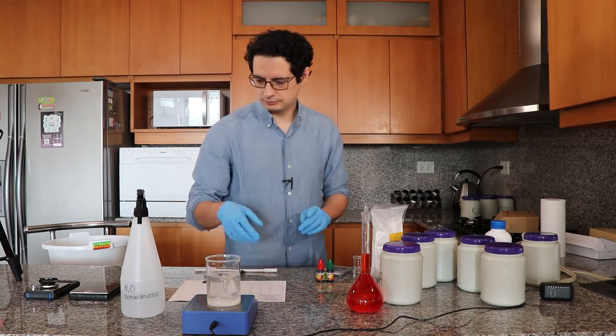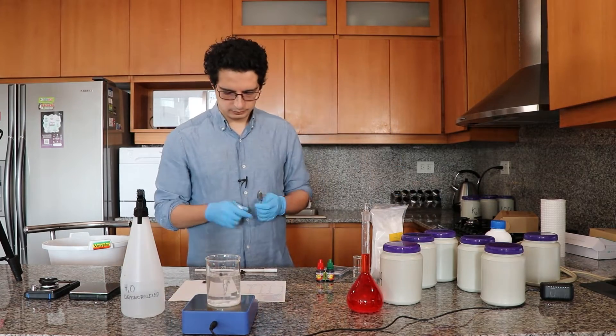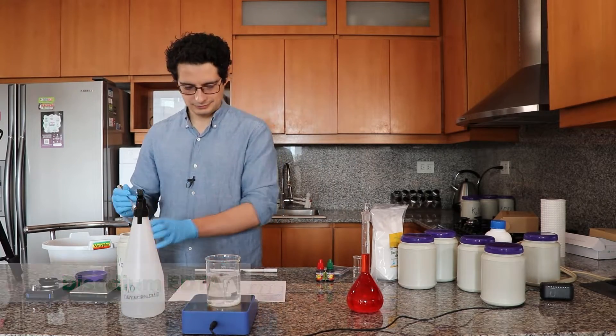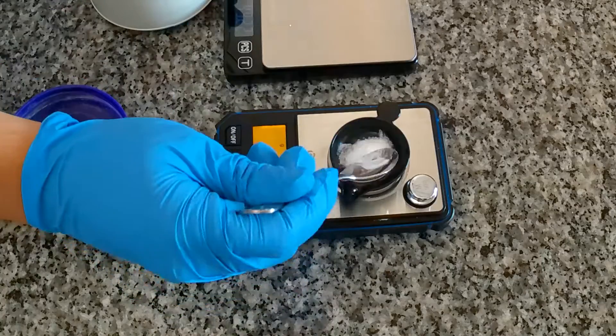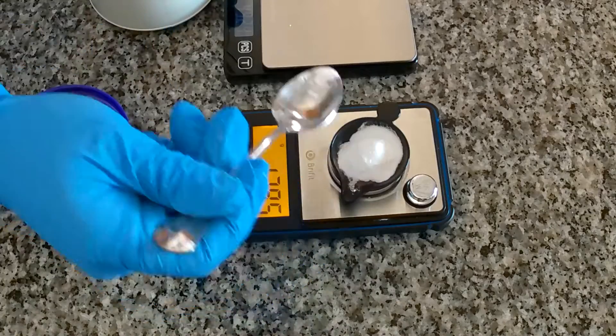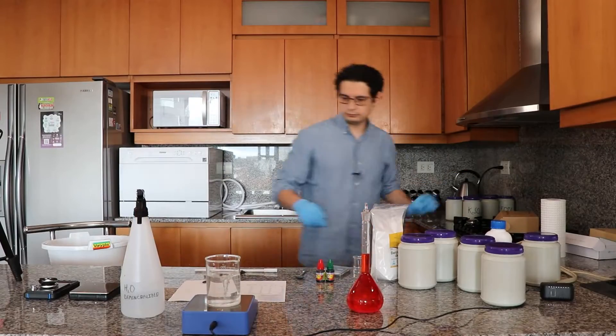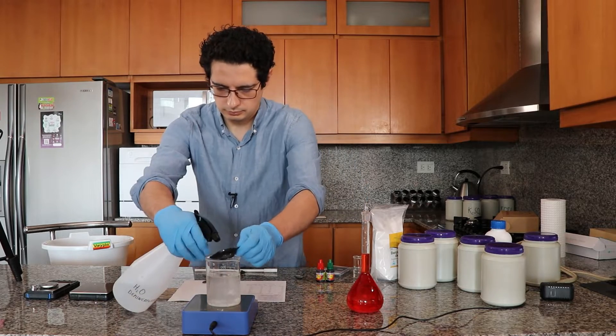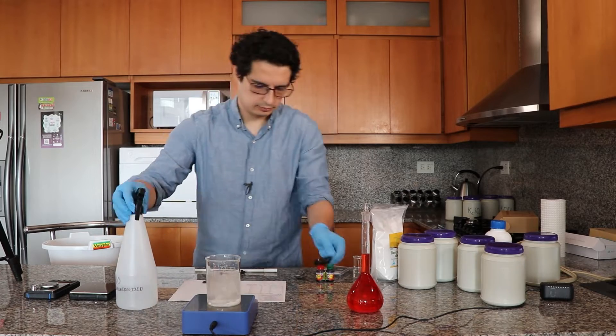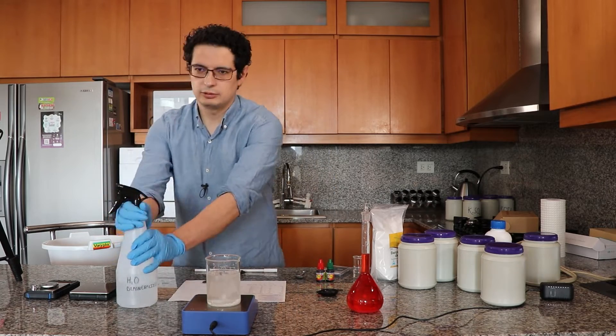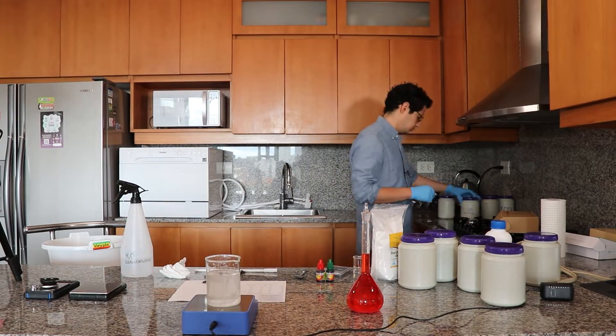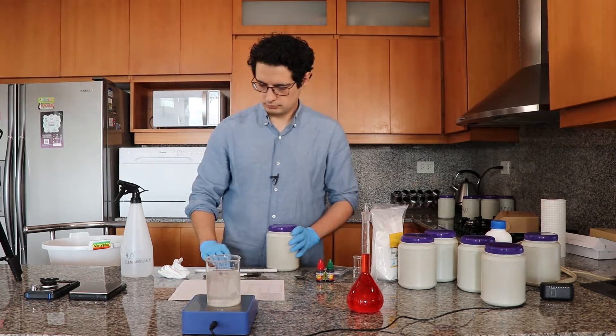After this, all the other substances I'm going to weigh in the smaller scale because we need to weigh a much lighter amount. So next is the sodium EDTA which is the chelating agent. I add it first because I want the chelating agent to be fully dissolved and available before I add the heavy metals so that no heavy metal precipitation reactions can happen, because they could happen if I added the sulfates first. So I'm adding the chelating agent first to give it enough time to dissolve before I add the heavy metal salts. Next I am going to add the monopotassium phosphate.